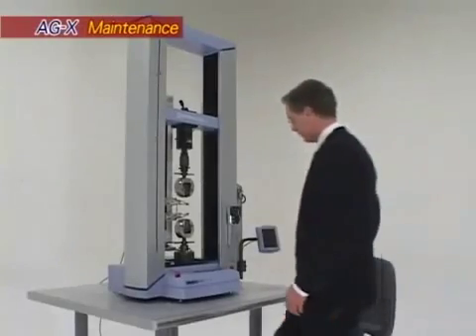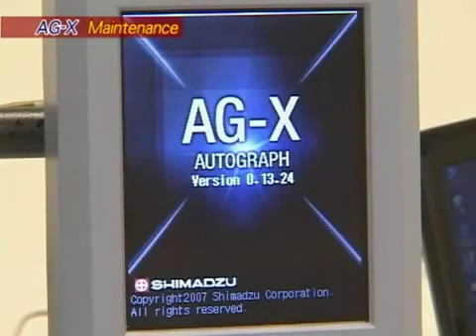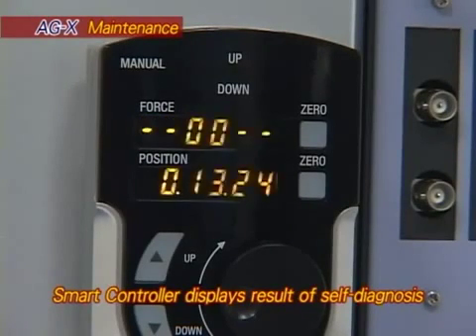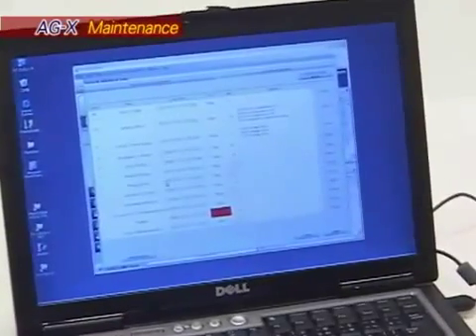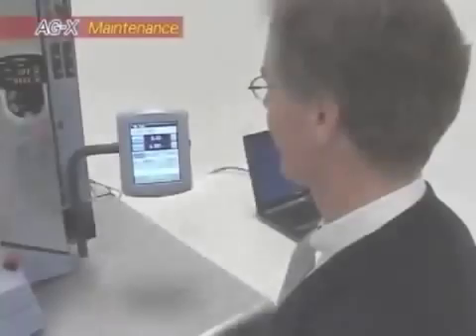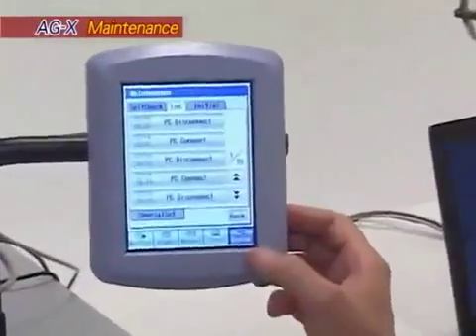Streamlined maintenance inspection. The AGX is equipped with a variety of self-diagnostic functions. Each time power is switched on, the AGX self-diagnostic function checks the system for problems. The maintenance message function displays messages at predetermined intervals, providing reminders when periodic maintenance is required. The operation log function records all previous actions in an operation log, allowing easy investigation of problem causes.